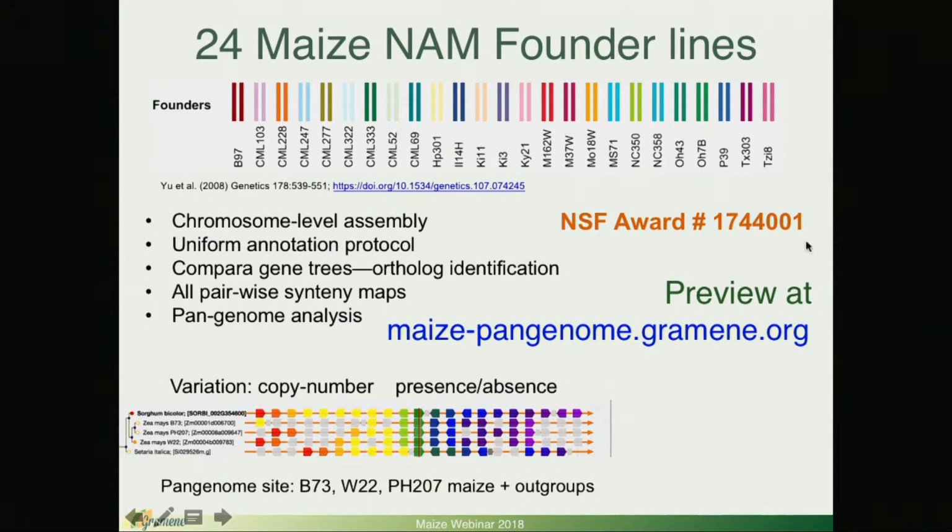This is independent from Gramene, but at Gramene we have a pangenome preview at maize-pangenome.gramene.org, and the project is about sequencing, assembling, and analyzing the 24 maize founders.